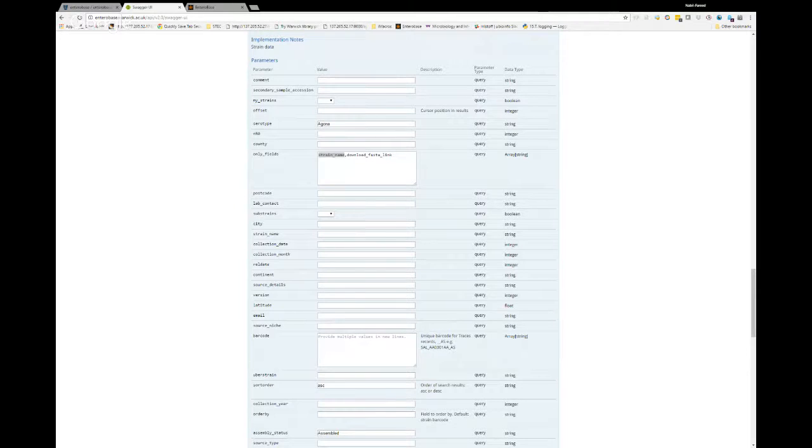And at the moment, those fields, such as host niche or host type or host details, we've tried to curate them at the beginning of the EnteroBase project as best we can. It's not done particularly well, and a lot of it is just verbatim what people put in NCBI. So we are at the mercy of what submitters put up on NCBI, and it's not always as good as it should be. So no, there isn't a controlled vocabulary reference. If there was, please let me know. We'd love to implement it.